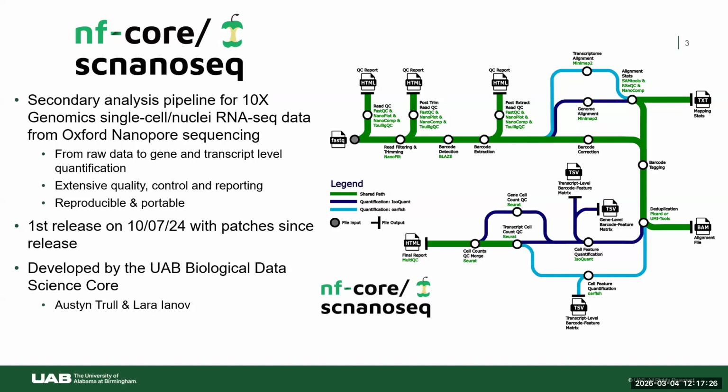After the alignment is done, we collect the alignment metrics to provide to the user, and this is compiled into the MultiQC report.